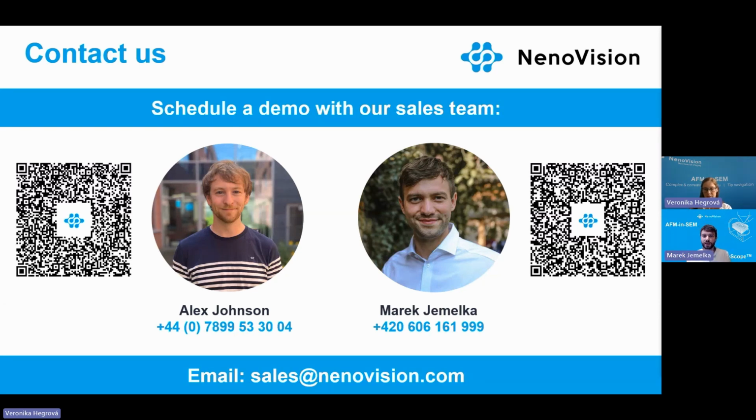Great, thank you. Second question I would like to pick. We still have plenty of time, so it should be fine to go through all of these. That one is from Dennis. So are you using self-sensing probes, he's asking? No optical detection. Yes, you're exactly right. We are using piezoelectric or piezoresistive probes. And for these analyses, we used piezoresistive. So from the voltage characteristics, we read the conductivity or the dopant concentration. So no laser is used.